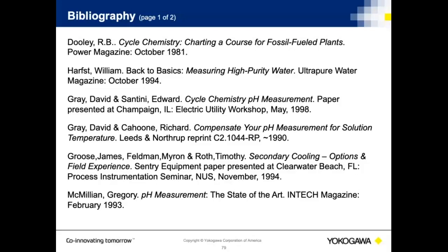Okay, thank you. Second question: can a Yokogawa combination FU24 smart pH sensor be used to measure high purity water? That is an excellent question, and the answer is yes, but there's a caveat.